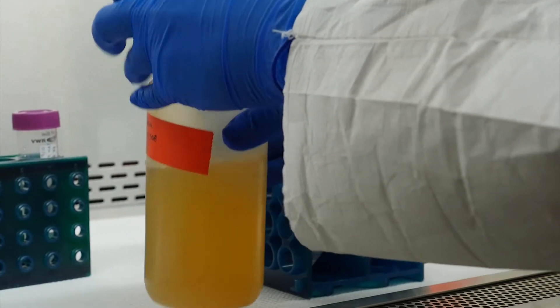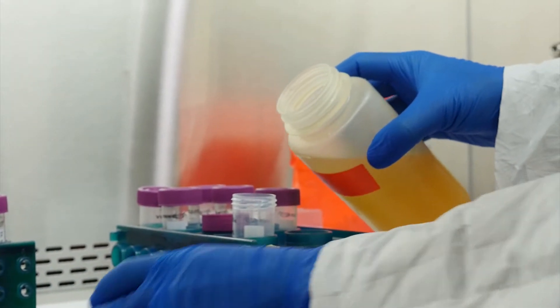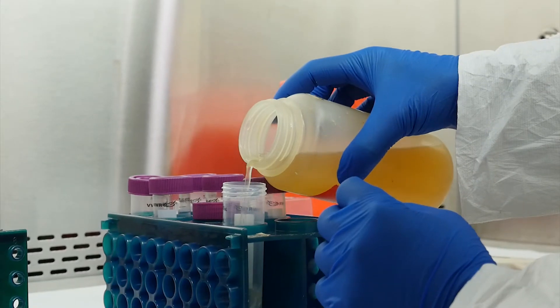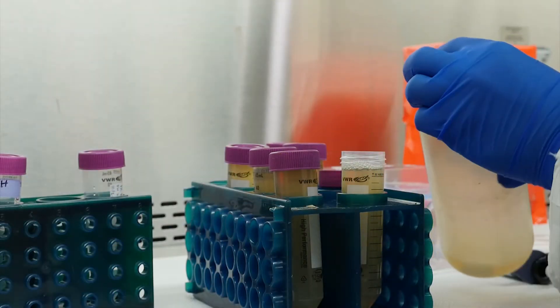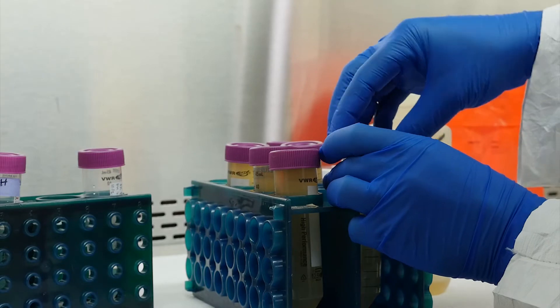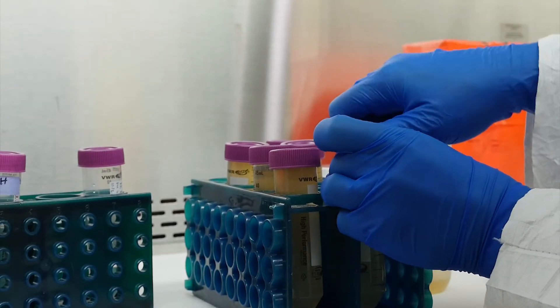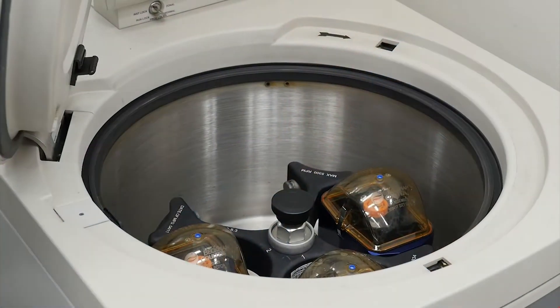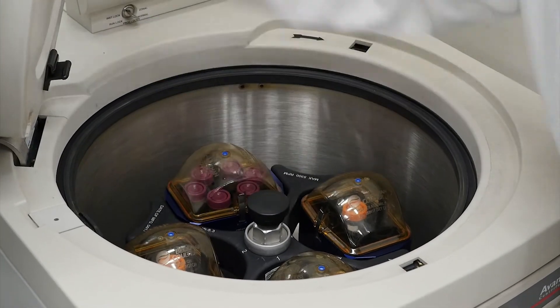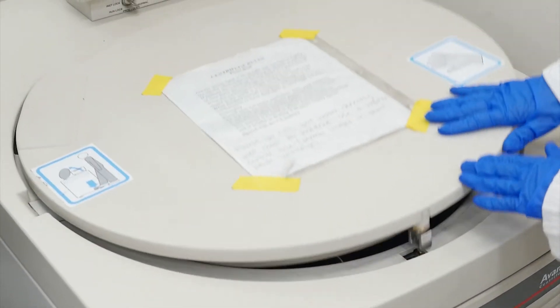After 2 hours has passed, remove the sample from the shaker and transfer the sample to conicals compatible with your centrifuge rotor. For this demonstration, we will transfer into six 50 milliliter conicals. Spin the sample at 3,500 G at 4 degrees Celsius for 30 minutes.